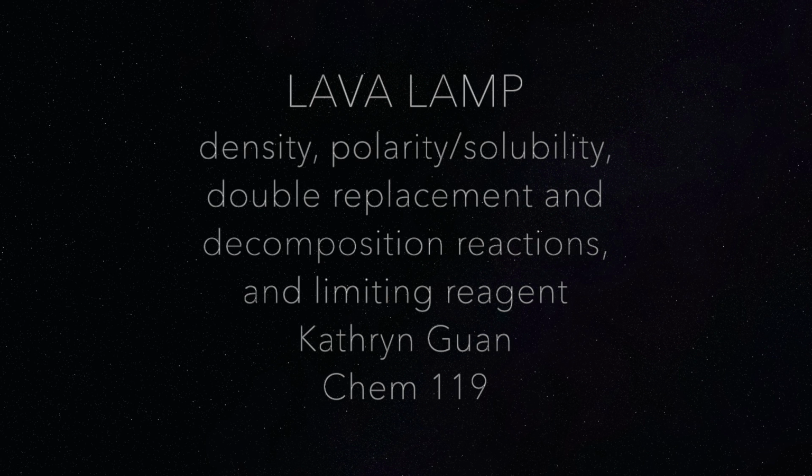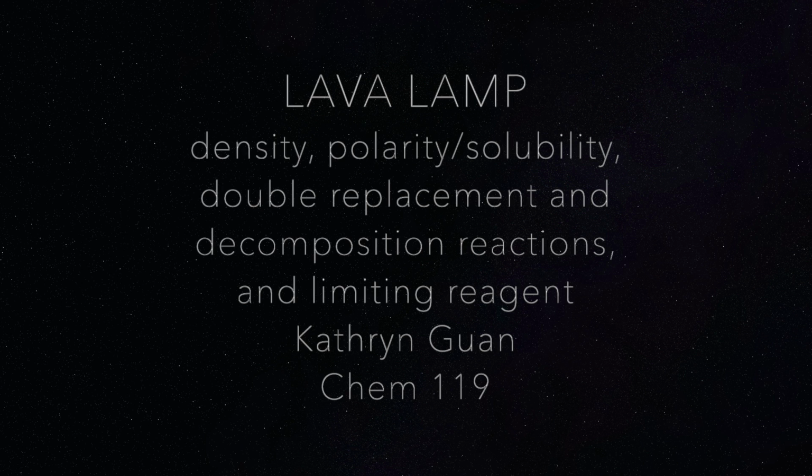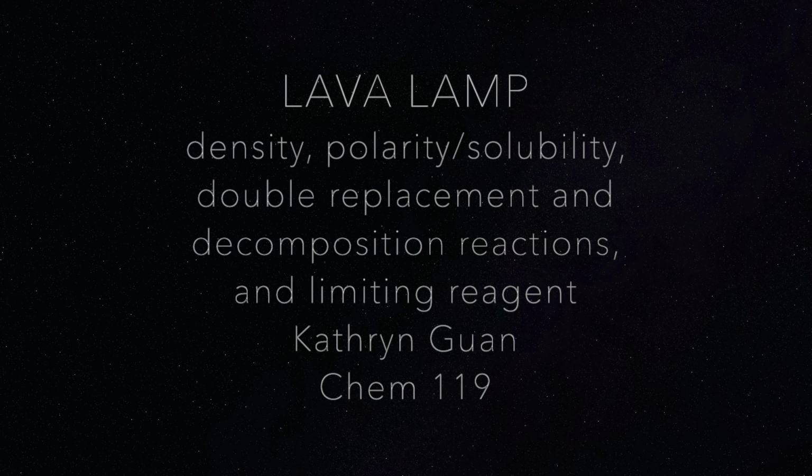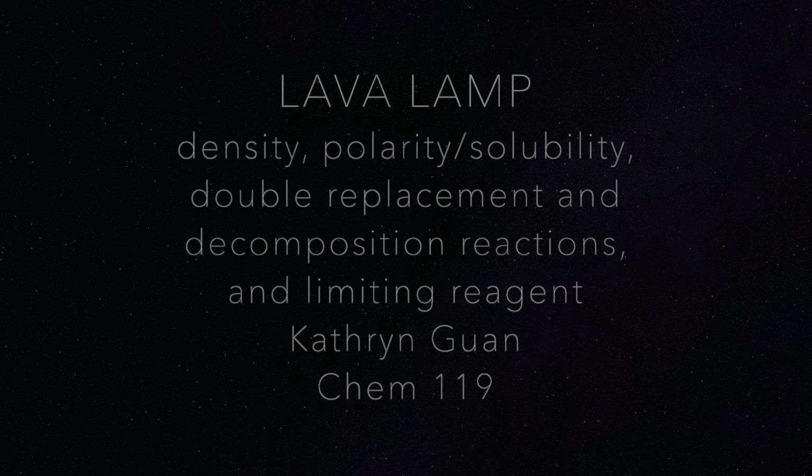So for my experiment, I'll be making a lava lamp, and overall this experiment will cover density, polarity and its relationship to solubility, double replacement and decomposition reactions, and limiting reagent.